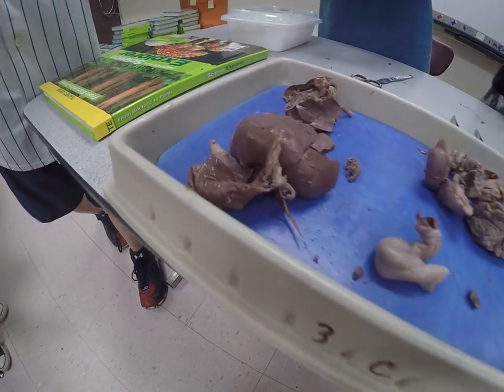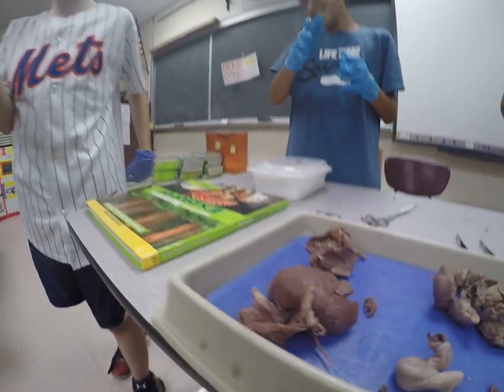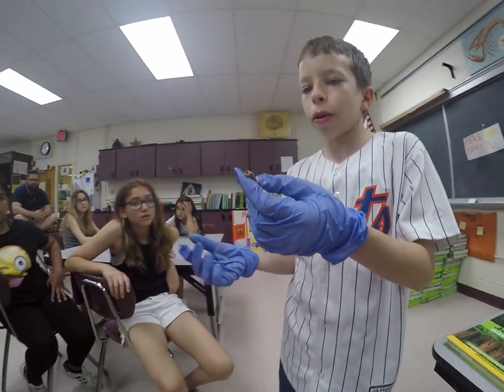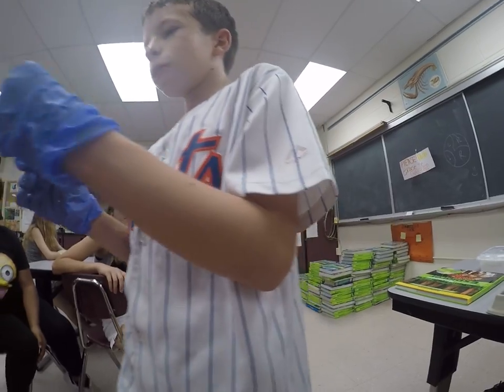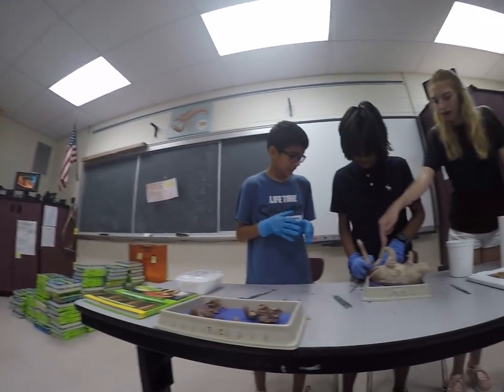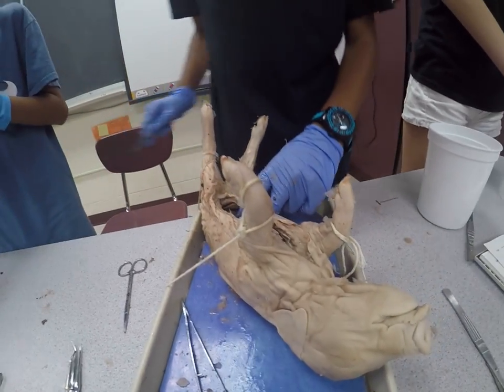They have somehow gotten part of the rectum, which is part of the anus, which secretes bodily matter. And if you look inside this tip of the hole, you can actually see some matter — waste — that is still in there.